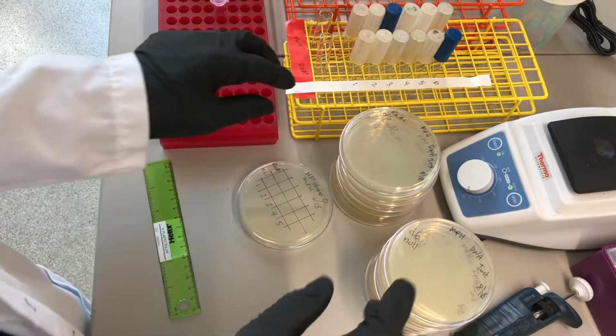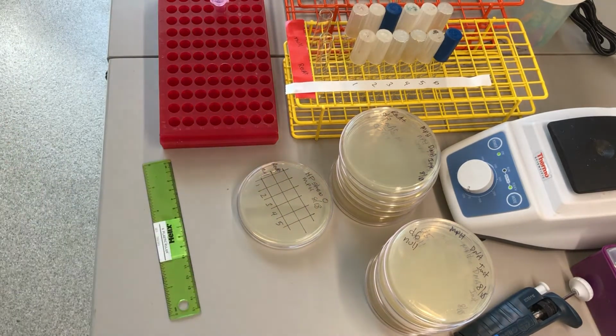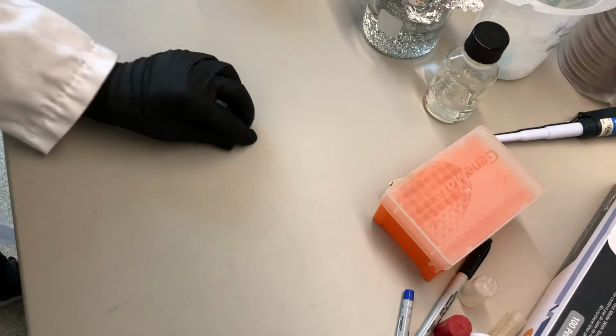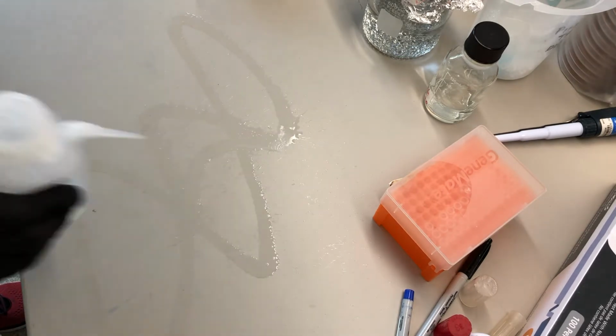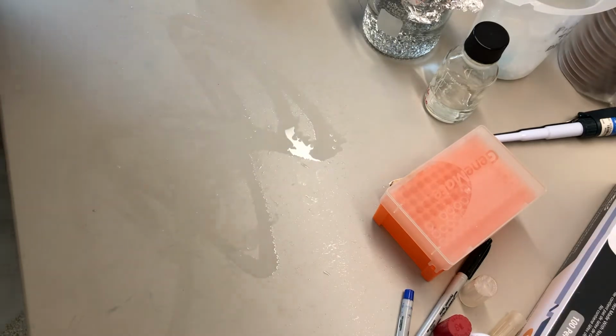If your plates are very fresh, it's helpful if you dry them while you're waiting. So that's what I'm going to do now. I'm going to spread the plates out. Clean off the surface here.